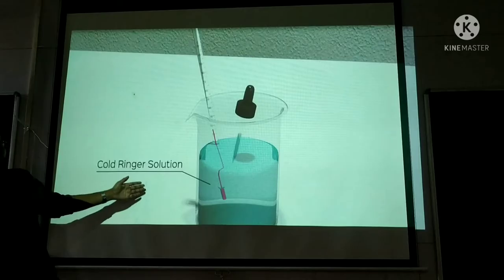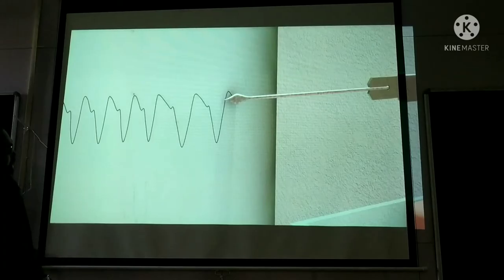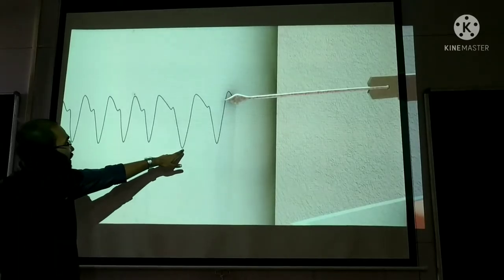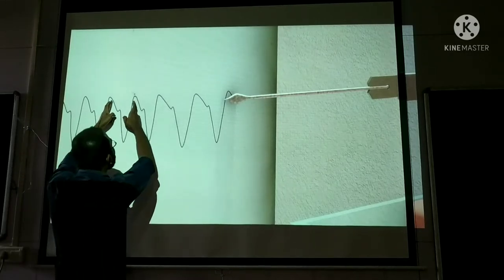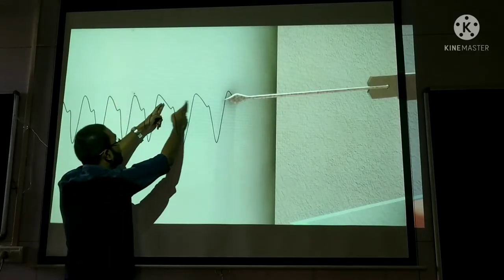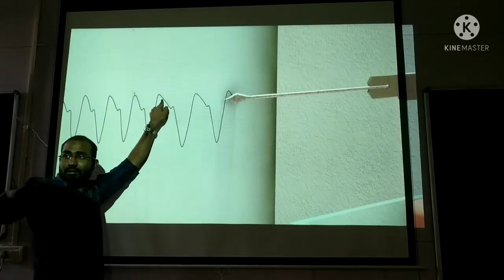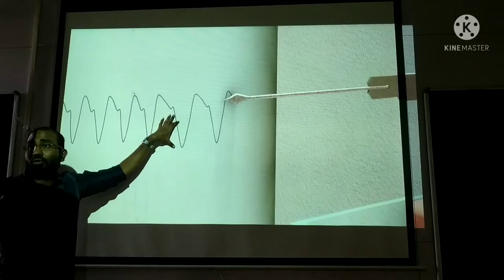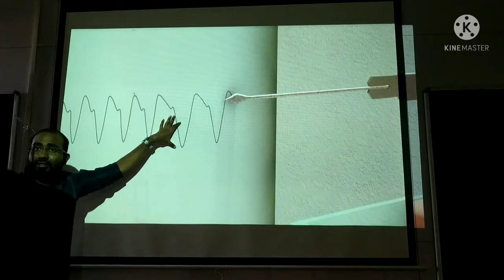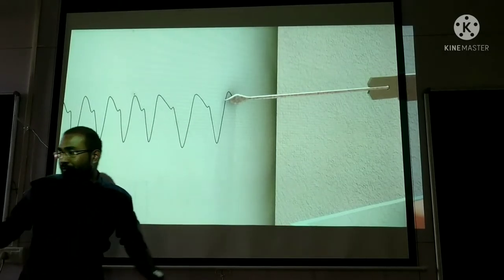We take a normal reading, then dip the blotting paper in cold ringer solution at around 15 degrees and place it. In the cold ringer solution, what you can see is that the height of contraction is increasing — force of contraction is increasing. The second thing is that the heart rate has decreased. That was the observation for cold ringer solution.